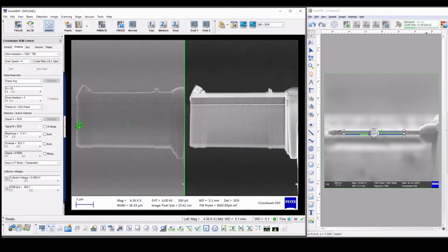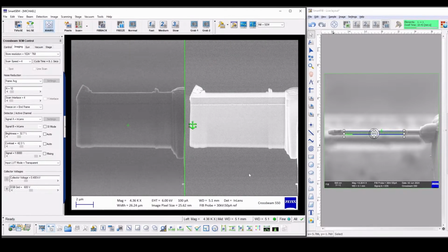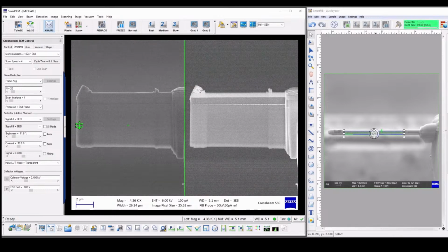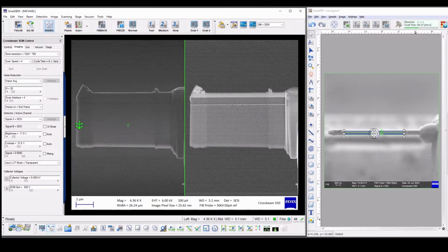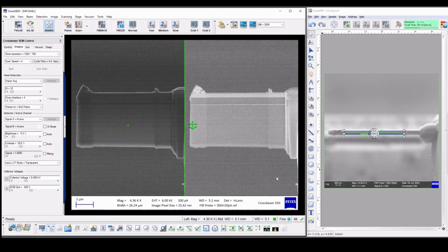The ideal is to watch, in this case, I have gold on carbon that actually has a little tiny strip at the top, on top of the silicon, that appears as a line basically in cross-section that serves as a pretty good marker on the lamella. So we're just watching it at this point.